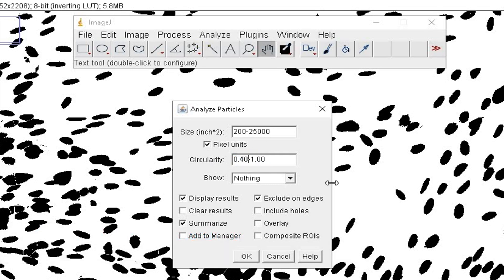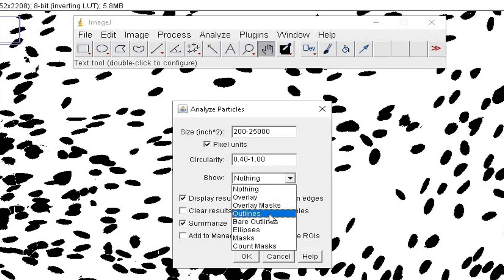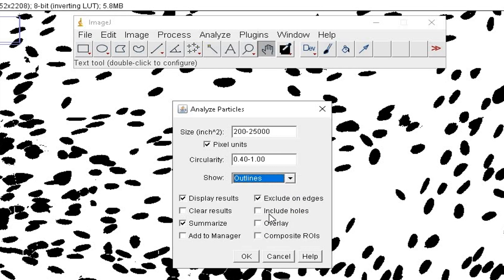In this dropdown, we would like to select the outlines for counting the number of cells. Check on the summarize and exclude on edge options, and then click OK.